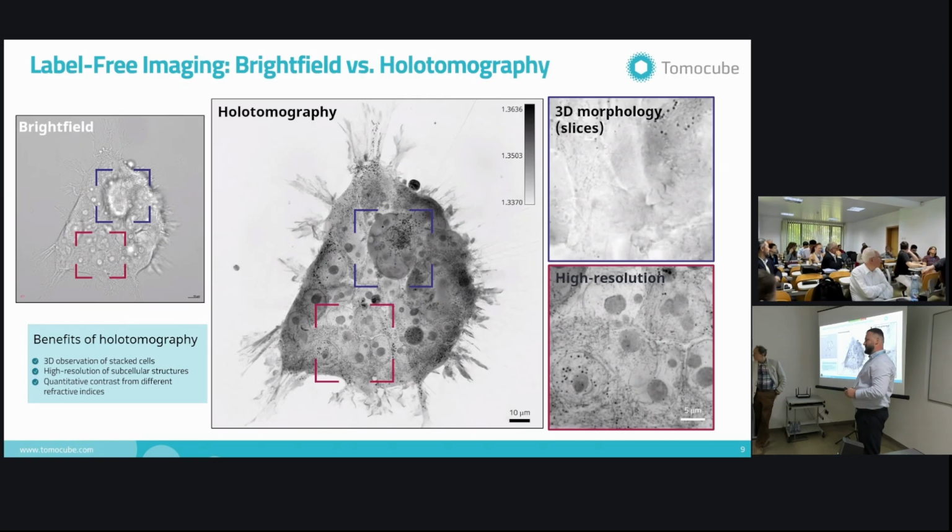I didn't quite get the question, but I think I have a similar question regarding the refractive index determination, because you said you were using it quantitatively to determine concentrations and so on. Do you have a clever trick there, since you're mainly measuring refractive index differences and objects are fuzzy and small and so on? It's not super easy to get the absolute refractive index, right?